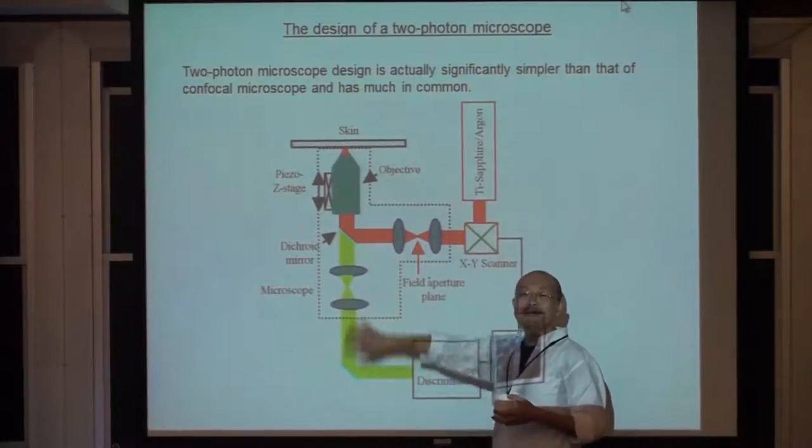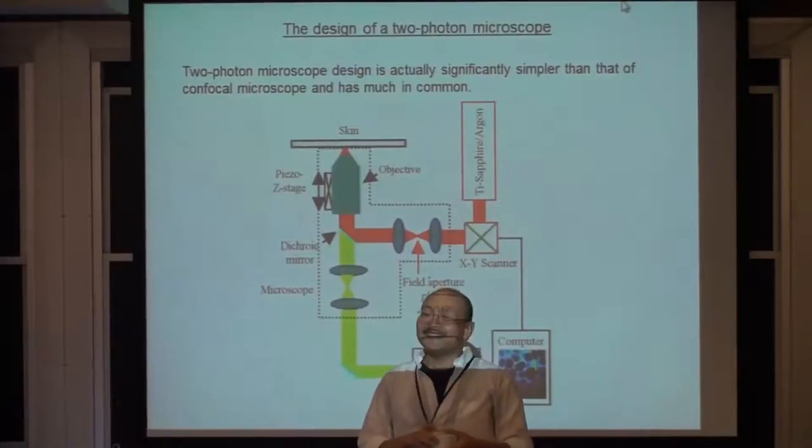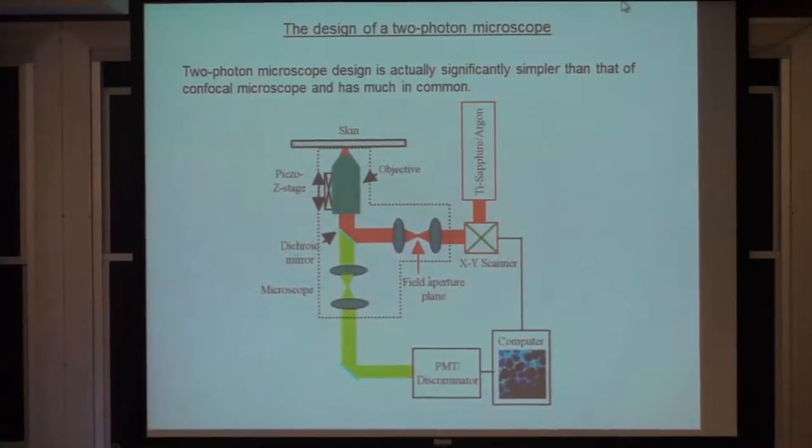And typically, we also have good microscopes. Good microscopes are important. But I guess your microscope is probably about maybe $1,000 worth of microscope. So if you go back to your own lab, a microscope that you buy, almost without fluorescence, is probably maybe $30,000 from Zeiss or Olympus.